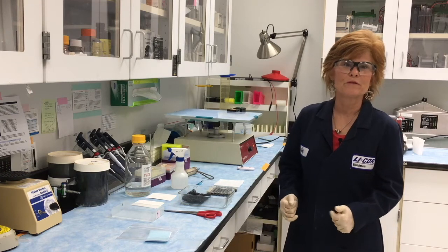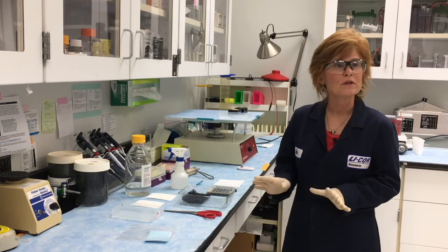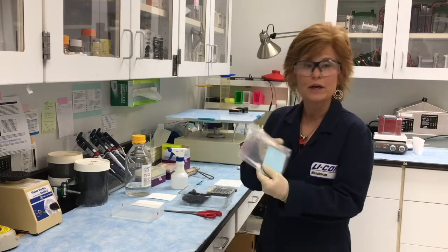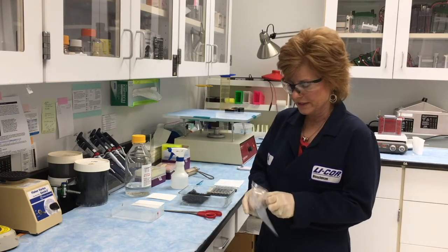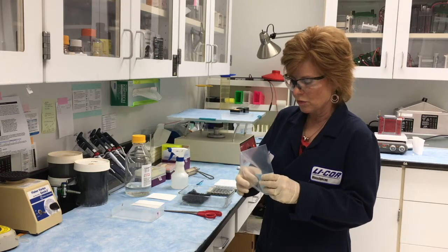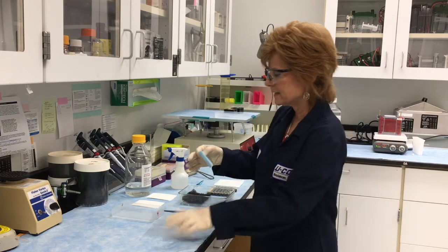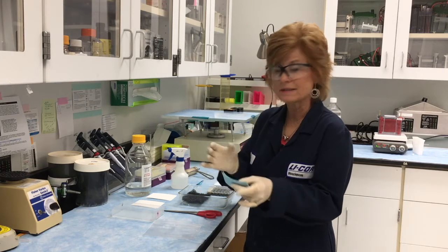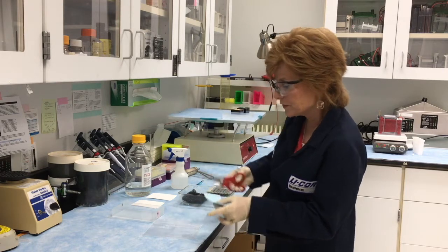While your gel is equilibrating for 10 minutes, be sure you get everything else ready for the transfer. Here I've got our membrane — I'm using nitrocellulose. What we want to do is get the membrane out. Please use gloves, and don't handle the membrane itself unless you're using forceps.